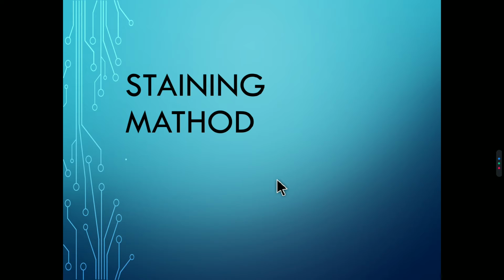In this video, let us talk about staining methods. As you know, the microorganisms are normally present in the atmosphere.